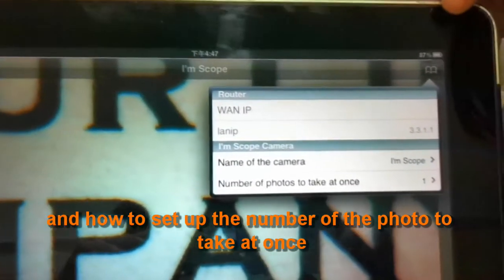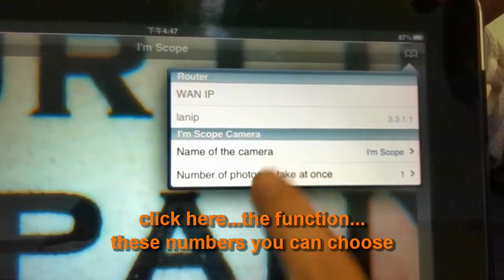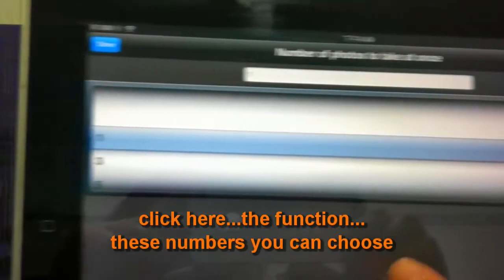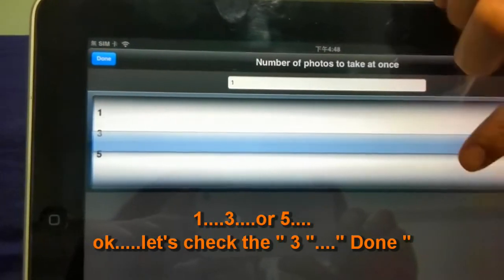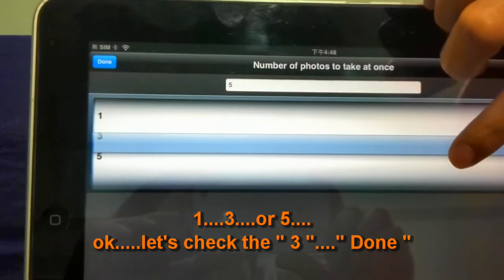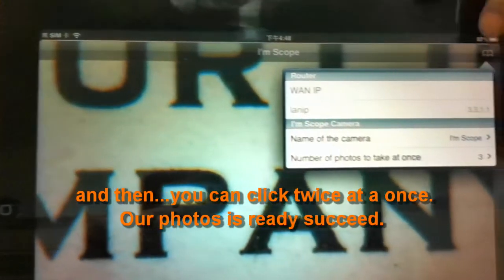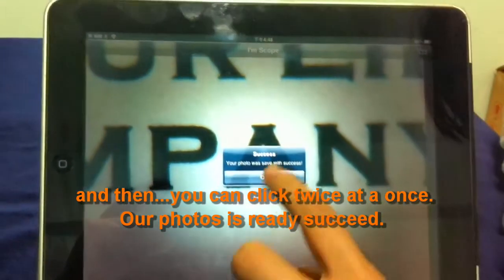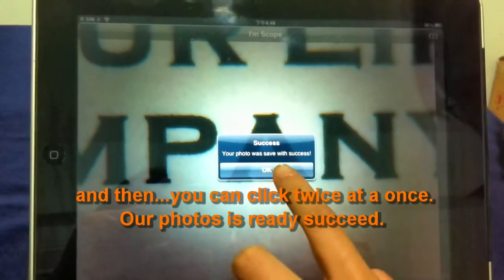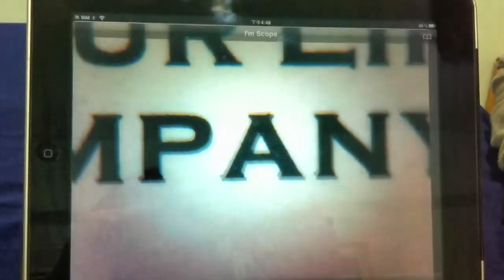How do you set the number of photos to take at once? Click the function button here — you can choose one, three, or five photos. Let's select three. Done. Then you can click twice to take them at once. One second — that's it. The photos are already saved successfully. You can click the right button, but be careful not to press the wrong button.